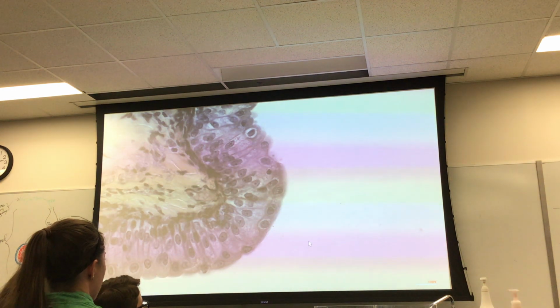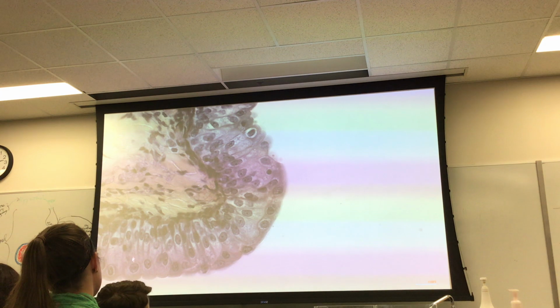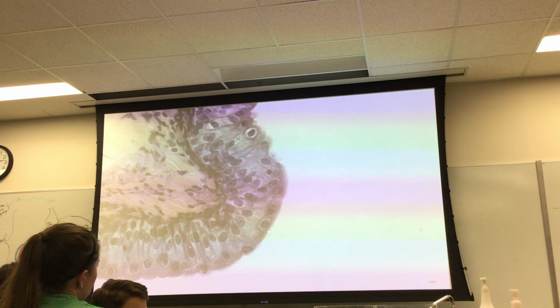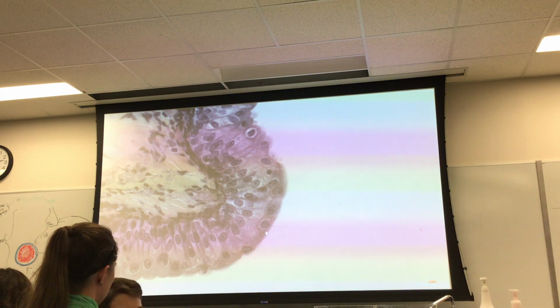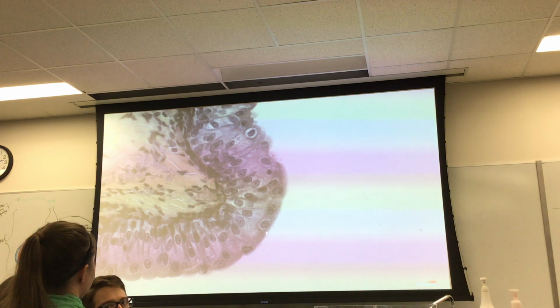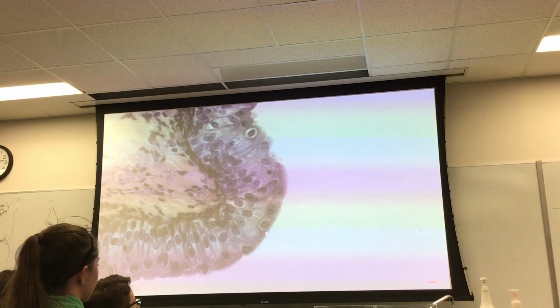We've done this before, but I'm doing something different here. This is a stratified epithelium. You might say, oh, these are columnar cells, but you have these cells right on the surface, and notice the nuclei are not flat, so this is not a stratified squamous, this is transitional. Once you've identified something as transitional epithelium, you're going to say, well, transitional epithelium has a rather limited distribution. It's either in a calyx of the kidney, it's in the ureter, or it's in the bladder.